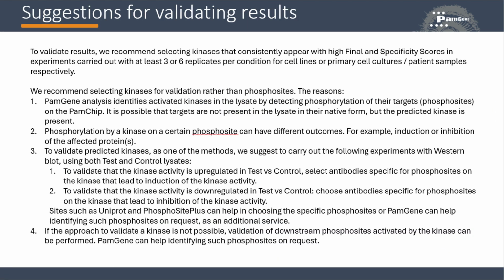If you would like to validate your results, here is a short guide about what to and how to validate. You can stop the video here to read, or you can find this slide in the PamGene Data Analysis Guide PDF.